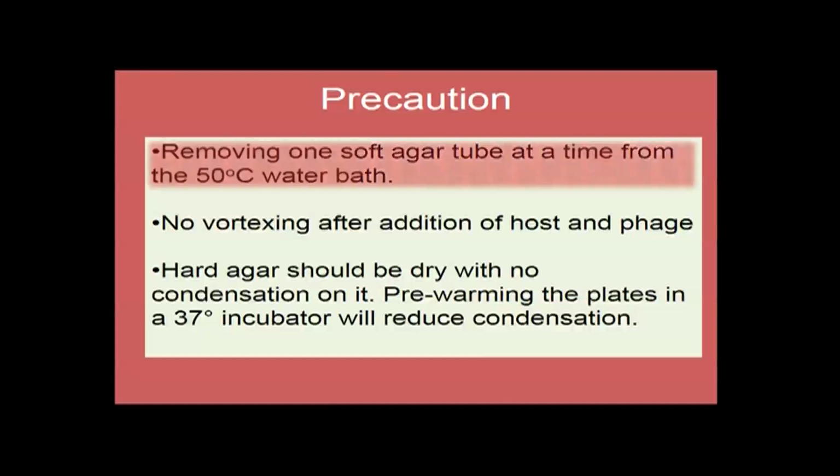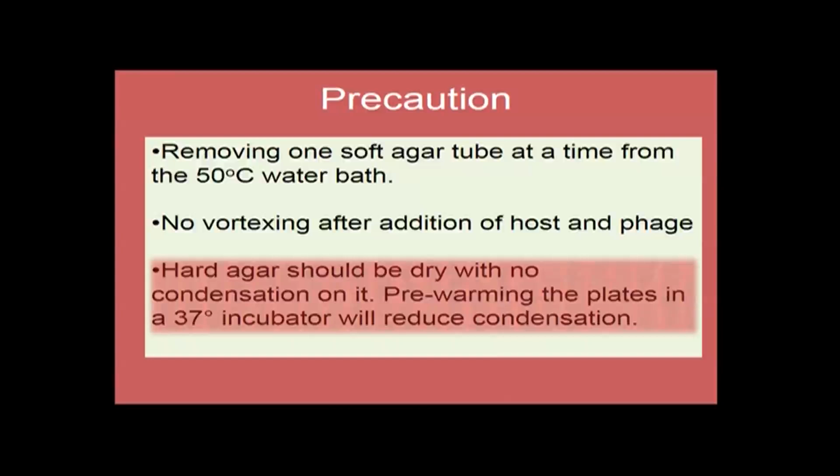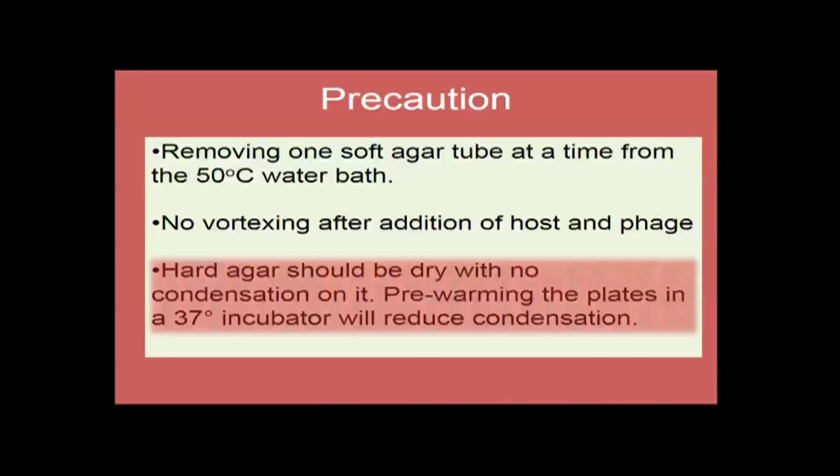While performing the experiment, we need to remember a few points: remove the soft agar tubes one by one from the water bath, otherwise it will solidify. Don't vortex when you are mixing host and phage. And when we are pouring the soft agar plus host and phage onto the hard agar plate, the hard agar should be completely dry and no water should be condensed on the hard agar plate. We can eliminate the condensation by pre-warming the hard agar plates in an incubator at 37 degrees centigrade. So just remember these things while you are performing the assay.